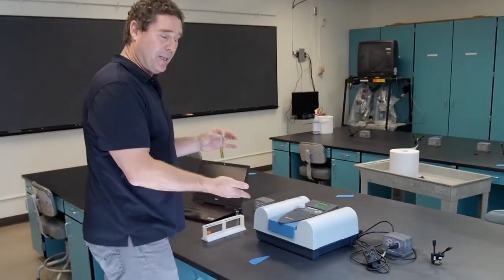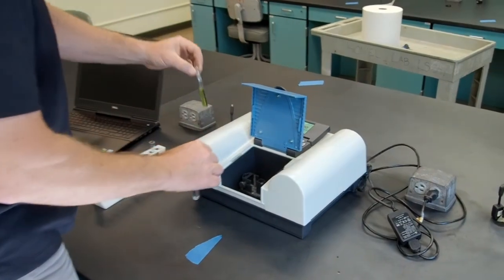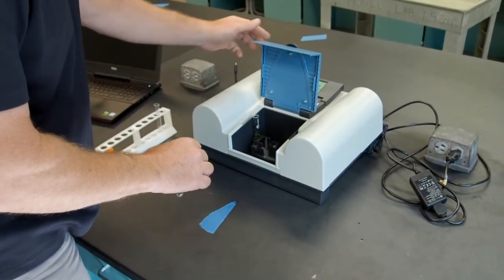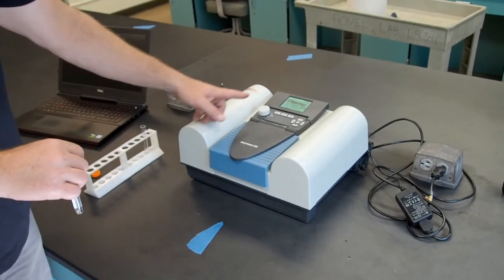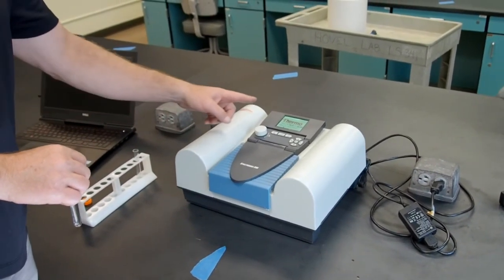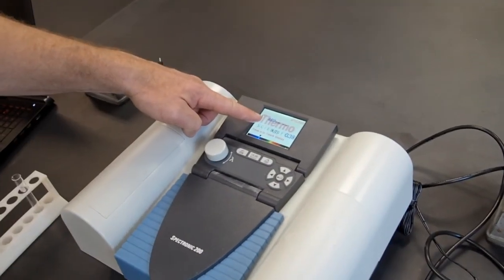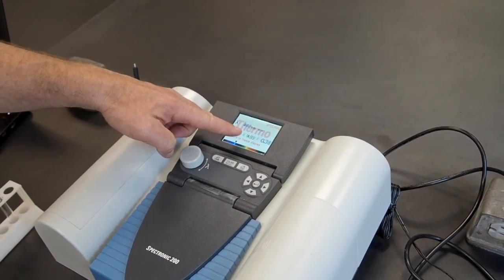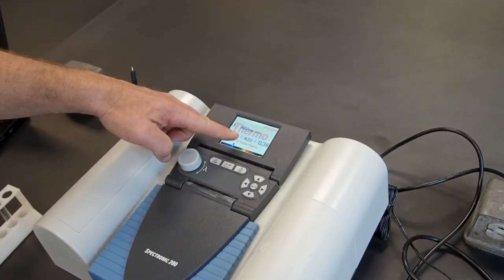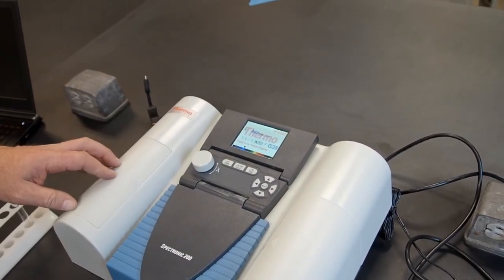We just zeroed the spectrophotometer. We're going to pull that out, put the sample in, close the lid, and allow the spectrophotometer to read the absorption. Again, what we're reading is how much light at this wavelength, 480 nanometers, is absorbed by our sample. So our reading right now is about 0.38. We're going to record that number.